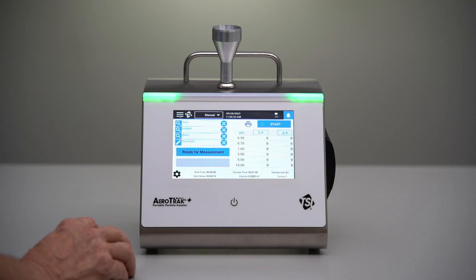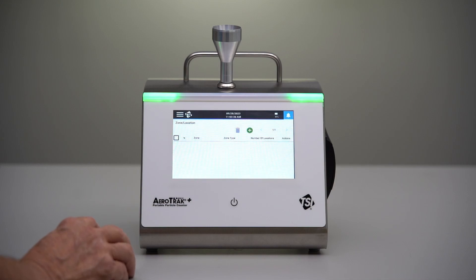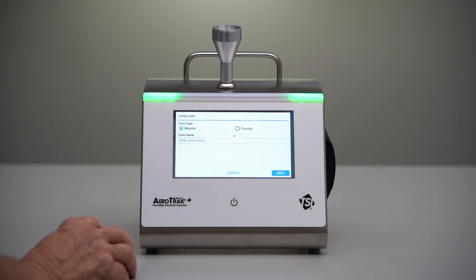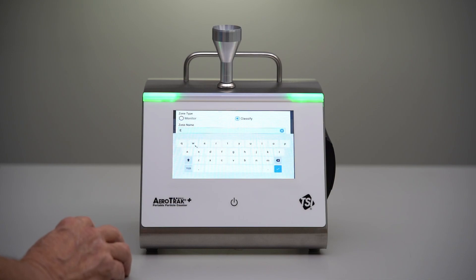To create a new zone, we go into the main menu and go to Zone Location, and we just click the green plus button to create a new zone. We want to make sure to select Classify. Monitoring zones are a little bit different and we'll make another video for that soon to show how to make a monitoring zone.